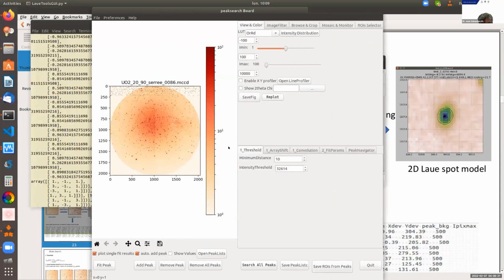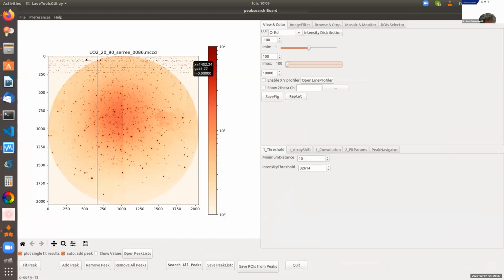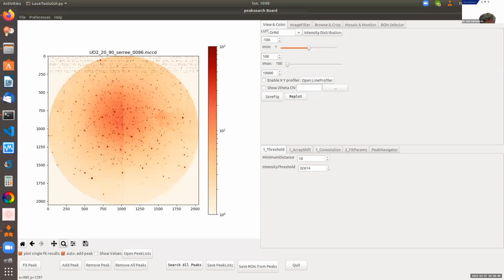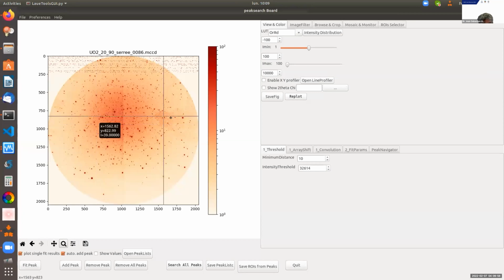Okay, I don't know what it is. Correlated file maybe, but you can see that we have plenty of spots, and it comes from a polycrystal. Actually, because I'm a bit of an expert, I think you can see there is a zone axis there, and this is an important spot. Then this spot should be a low HKL spot, and you can imagine that there are some zone axes that will intersect at this position.